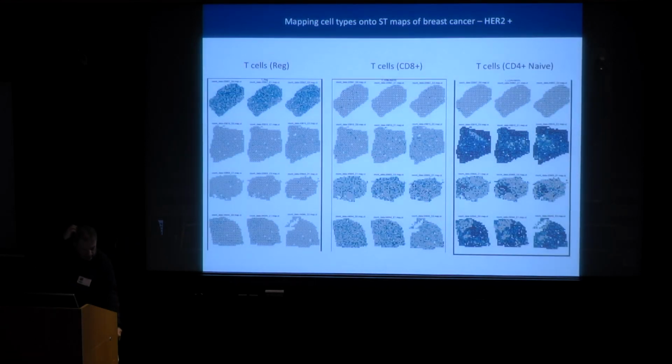A challenge, as I mentioned early on, is tumors. It's extremely challenging because you have large patient-to-patient variation. And we definitely need new tools here to better understand this. So this is just an example. These are triplicates of 4 patients. We're looking for T cells. Where are they present? The more blue indicates presence of those cells. And you could see a very wide variety in the presence of these cells. And there is much work to do. And I'll come back to this later on, actually.